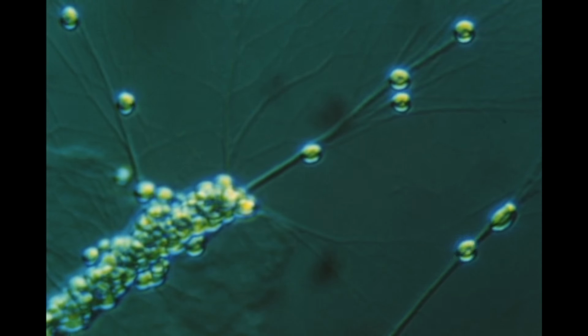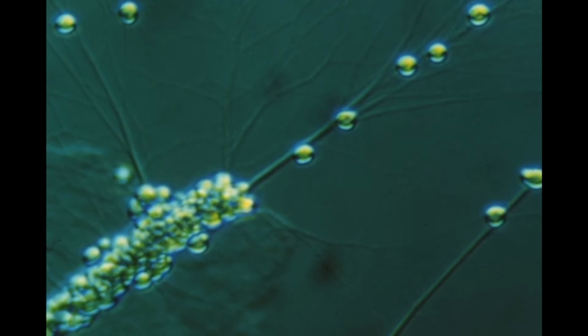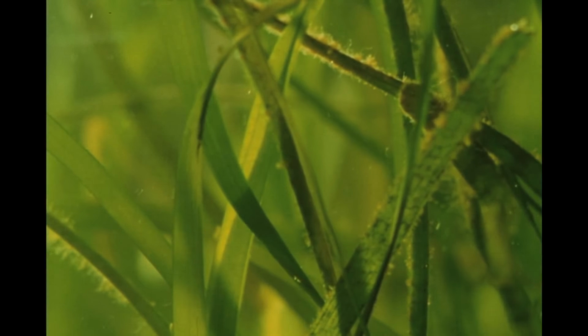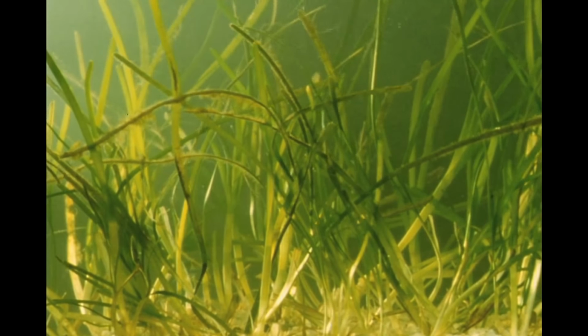Labyrinthula is a common marine microorganism found along the seashore, associated with various seaweeds or marine grasses, such as eelgrass, Zostera marina, from which cultures may be isolated. Labyrinthula demonstrates a primitive colonial organization characterized by gliding movement of the individual cells within a continuous filamentous network.